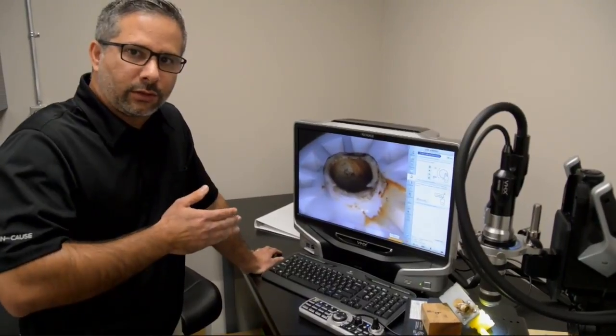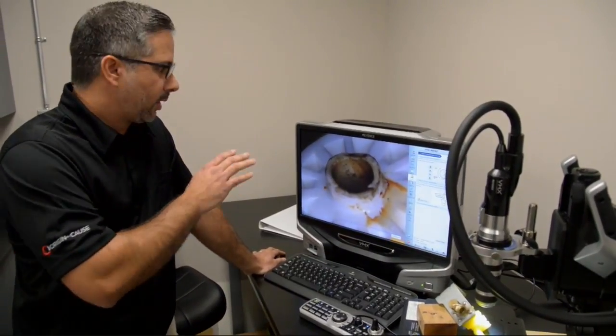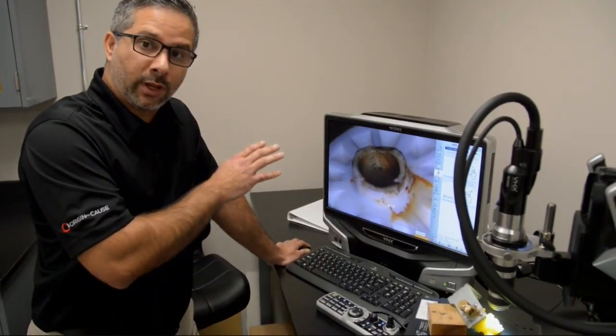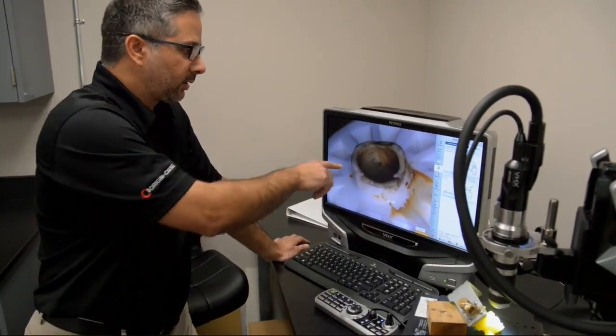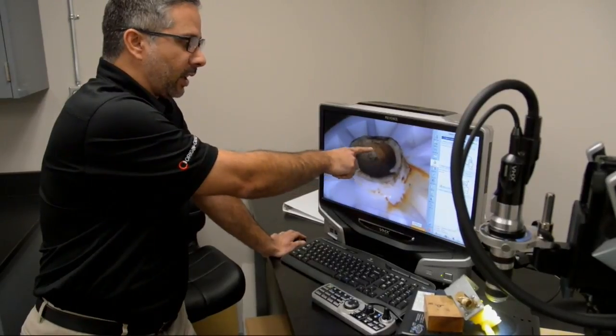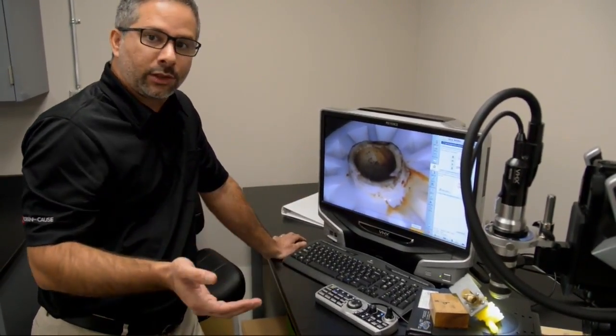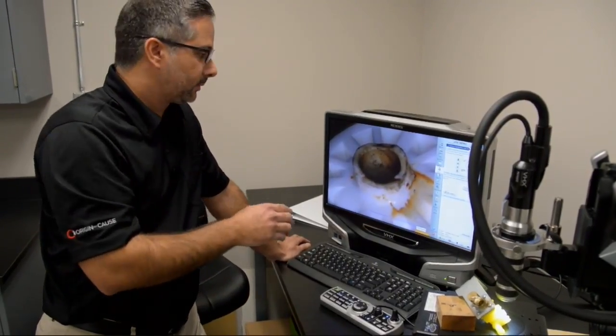So this is how it looks under the microscope. It's a very general frame at this point. I'm going to zoom in to see what's going on. Basically, the water runs on the inside of this feature here, and it flows from the water supply into your dishwasher. Let's see how it looks inside.